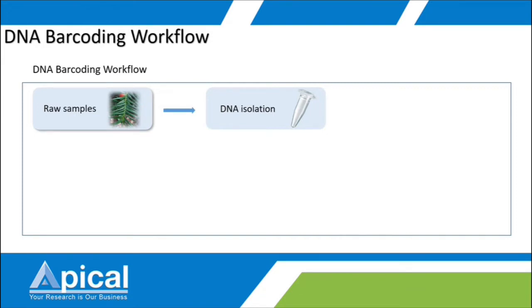If there is a mixed isolate, then the sequencing result will be noisy. Then maybe you will ask me, my sample is a mixed isolate, then how? For a mixed isolate, you can actually go for amplicon seq under NGS application. From there you can know nearly all the species inside your sample.